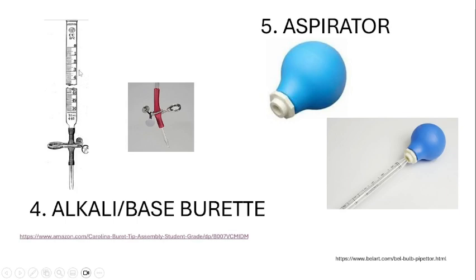Just like the acid burette, this burette is designed for bases, so we place base reagents here. Otherwise, blockage again. This is also expensive. We are told to be careful not to break or chip off this tip here, because it will be charged to you if you do so, and it is also harmful if it can injure anyone in contact with the chipped edge.